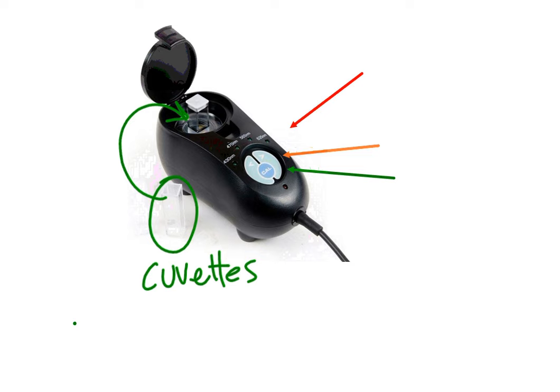In this case, it's kind of hard to read in that picture, but I want to say it's 635 nanometers. That's the one we're going to choose. We're going to choose 635 nanometers. And as far as whether or not your colorimeter is set to that, you can click on the light blue arrows, or the light blue buttons, which have the white arrows on them, as indicated with the orange arrow right here.